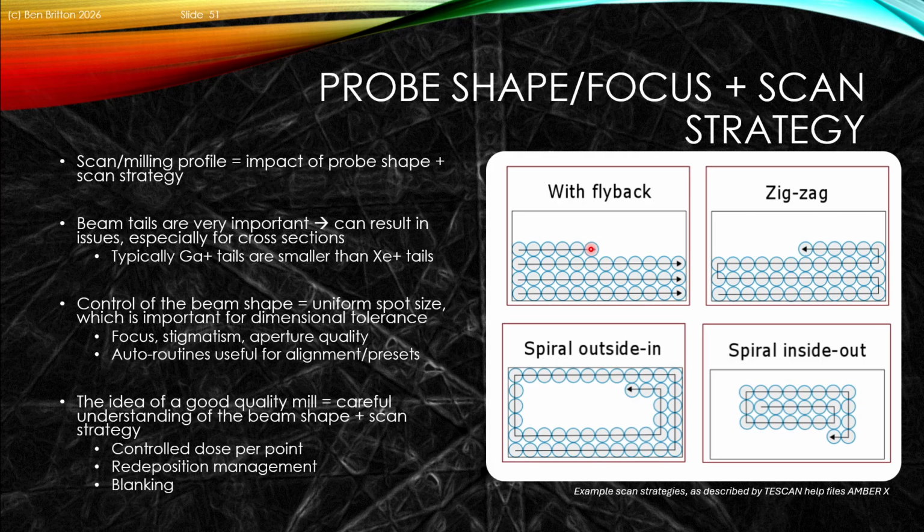You'll want to care about where you eject the sand to enable you to cut that hole. And so we can have effectively one method. The simplest and cheapest is just to scan in a line and then say go back to the left and scan in a line. It's kind of like an old-fashioned typewriter. Now at this you can see with the cursor that I have to fly back the beam. And so there can be, if you don't blank the beam quick enough, there can be incident ion damage as this beam is flying back.